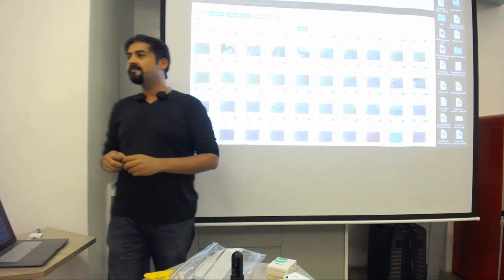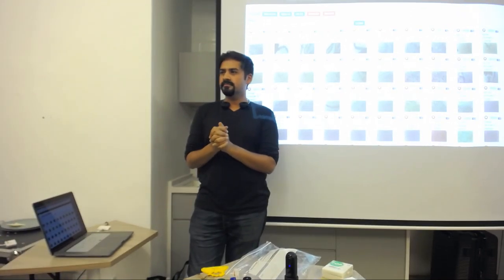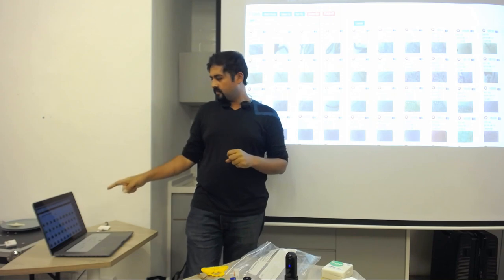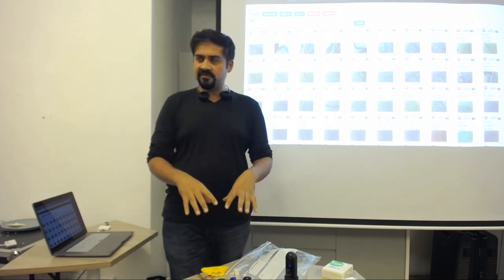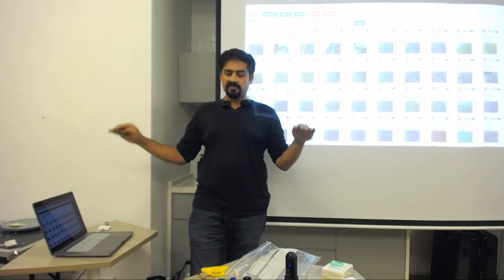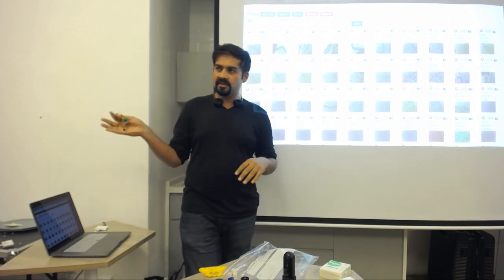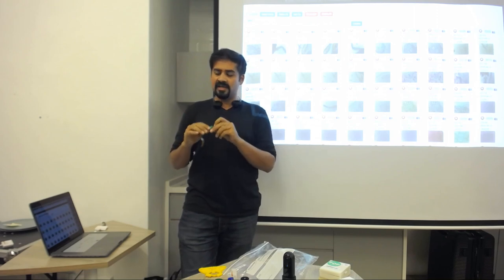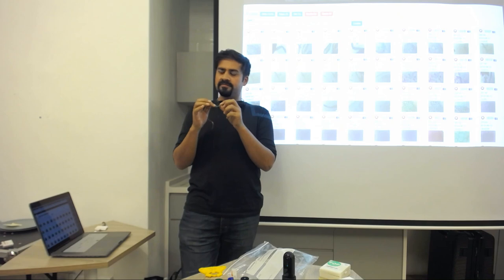One more question. Yes. Is there any hack to make it magnify more? Yes. On the GitHub repository, there is a lot of documentation. Recently, they've added the waterscope stuff, so they've made a comparison across different cameras. The 5 megapixel one seems to be the highest magnification that you get out of the box, if you reuse the same lens that focuses the image onto the sensor.